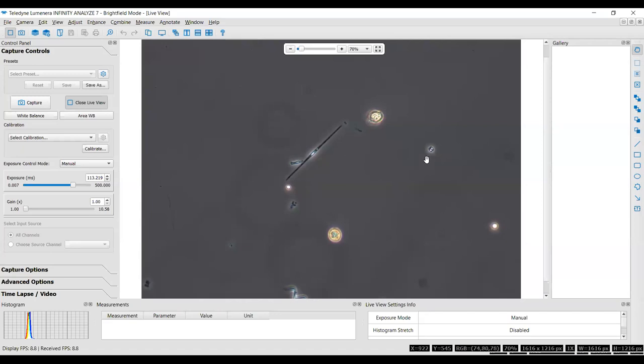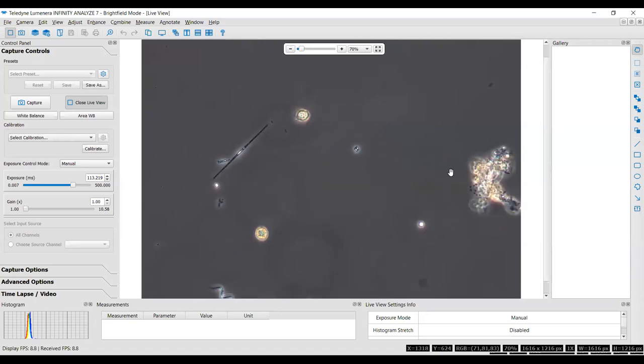And this little guy over here, yay, that is a little Snowella colony, just 2 cells. Now, you're wondering, how can I tell the difference between it and 2 cells of Woronichinia? Woronichinia is somewhat asymmetrical, top to bottom, because remember how it's inserted into the colony. I can actually see cell wall in detail in this. See how it's kind of open at the end there? Those are not aerotopes, that's actually cell contents. So at first it would look kind of similar, but they actually do look quite different.